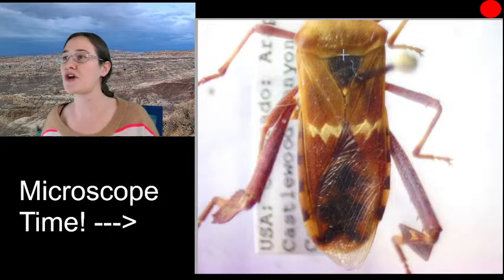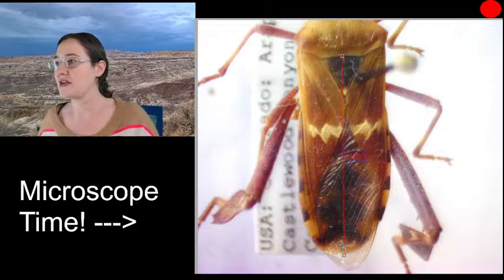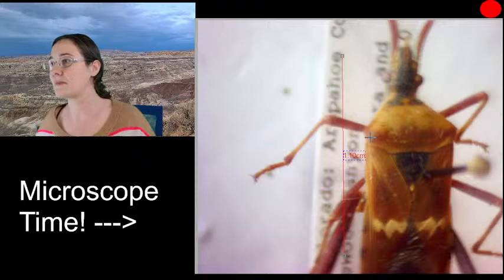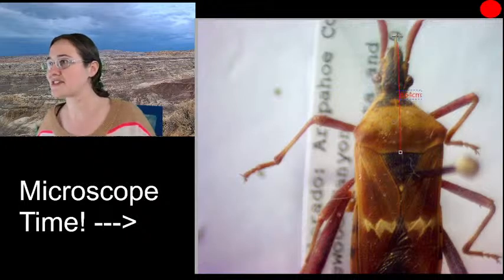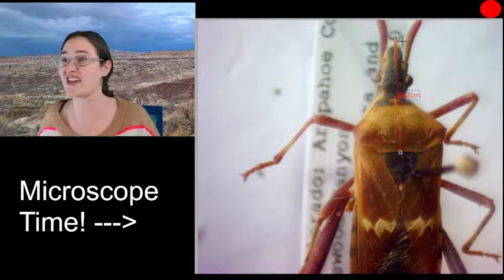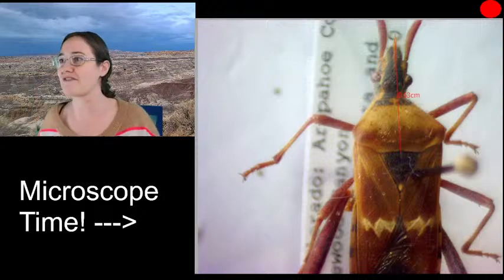Here, this is what we'll do. We'll go from this line. So from the scutellum down to the end of his abdomen, he is 1.1 centimeters. And then from here to the front of his head, he is approximately 0.6 centimeters. So you've got 1.7. He's about a centimeter and a half total.